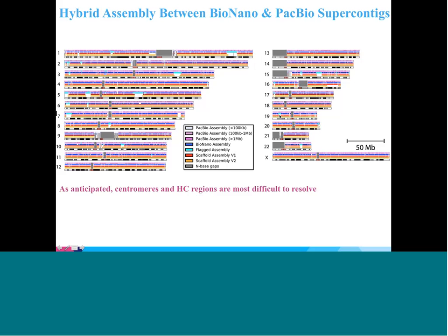Similarly, on chromosome 18, we had multiple genome maps on both arms, and we resolved both the P and Q arms completely. They're entirely consistent with the underlying reference. Internally, there might be small structural variations, but the end and the beginning of these alignments are completely consistent. And internally, as we'll show in a little bit, you can see that the genome map alignments are quite consistent with the underlying assembly.